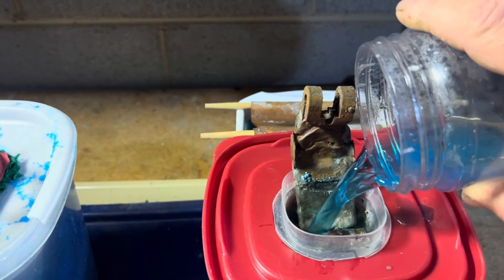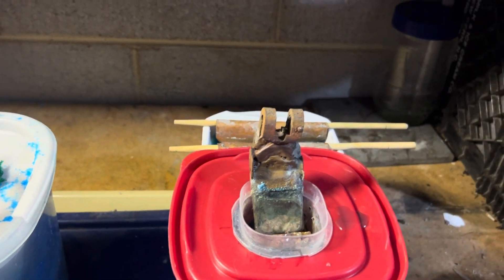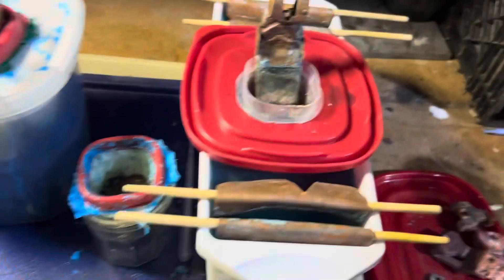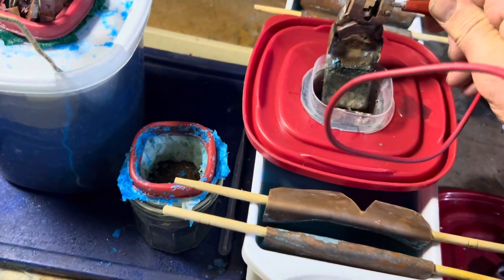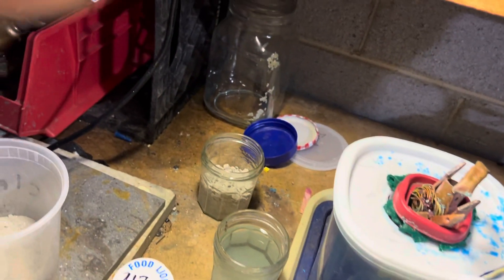We are going to start this cell up. So this would be the positive side of your power supply. It's your positive, and your cathode is going to be your negative.